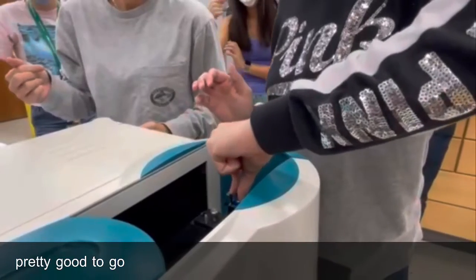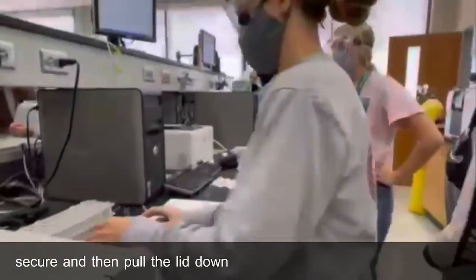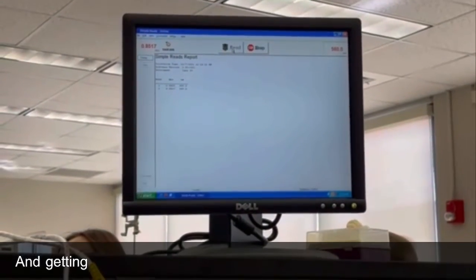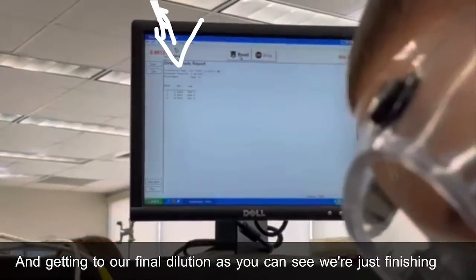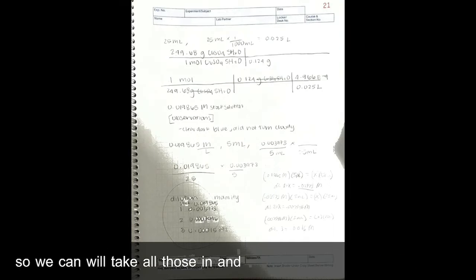So we're just going to slide it in there, make sure it's secure, and then pull the lid down. Then again, we are going to run our 2 to 3 trials and calculate that average. Getting to our final dilution, as you can see, we're just finishing up here at the top where that little arrow is. That is our 3 scans that we ran. So again, we'll take all those in, get that average, and then start the calculations.